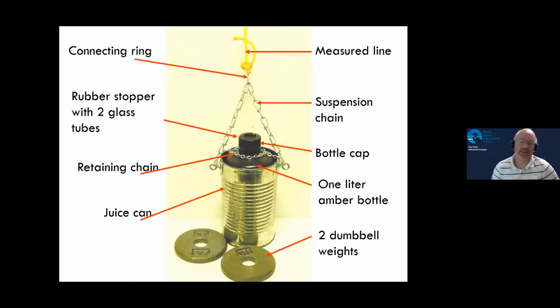And what it functionally does is allows you to take water samples over a wide range of depths because it has these little tubes coming off the top. So the water is going to enter this sampler slowly over time as you pull it up through the water column. It's fully disassemblable, which you should do between every time you make a sample. You should take this thing apart because if you just leave it all together, eventually it will rust out. So you want to make sure that you take it apart and dry it.